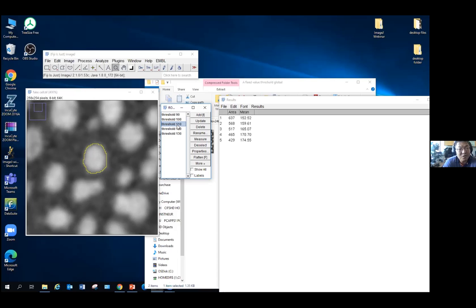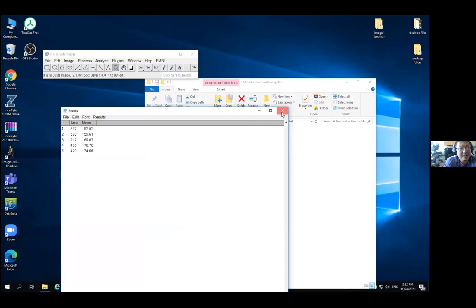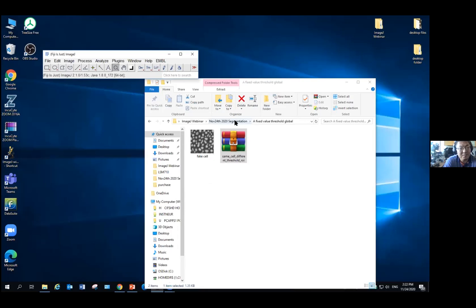They basically look at the image, pick up all the pixel information, the histogram, do some calculations, and then try to guess what will be the best thresholding to separate your pixels into two groups. And ImageJ provides quite some functions to do this.